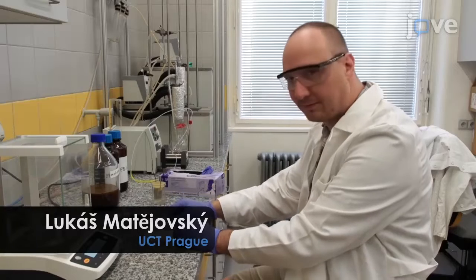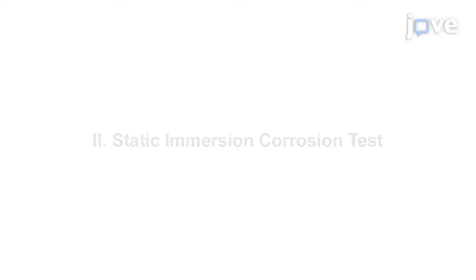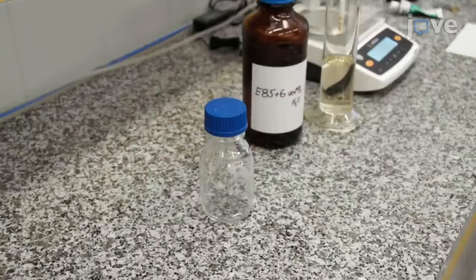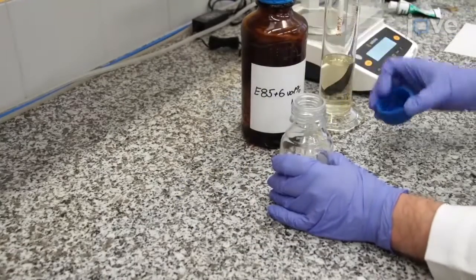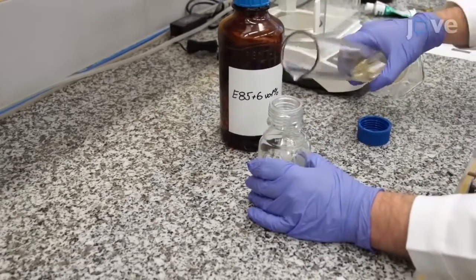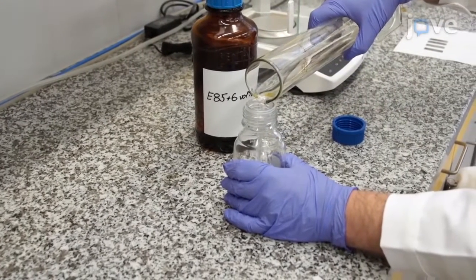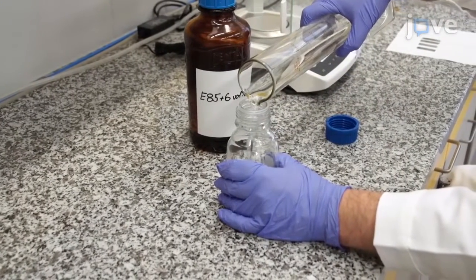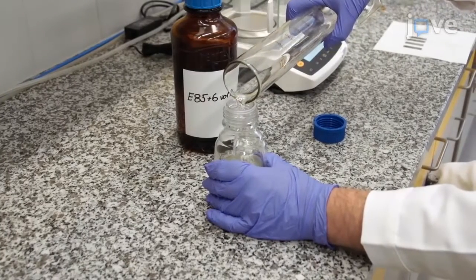Demonstrating the procedure will be Lukasz Mateuszki, a member of my team. To test the static immersion corrosion of metal-liquid systems, begin by adding 100 to 150 milliliters of the tested liquid corrosion environment to a 250 milliliter bottle equipped with a hook for hanging an analyzed sample.